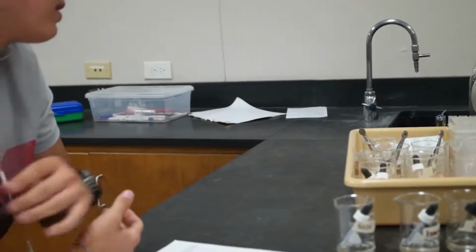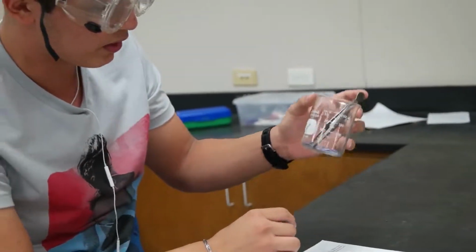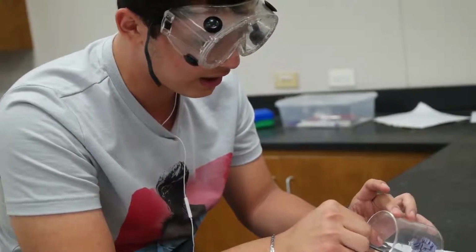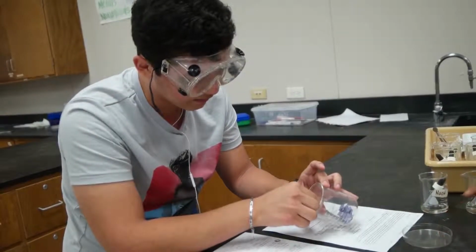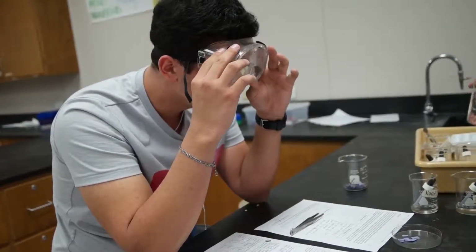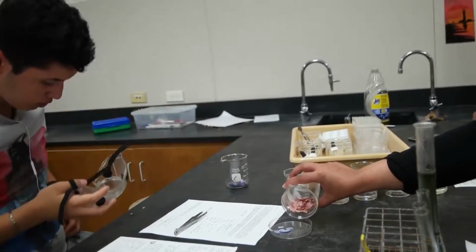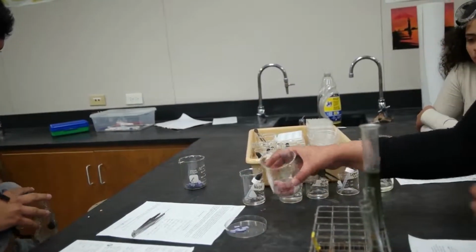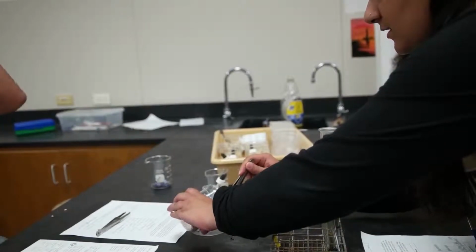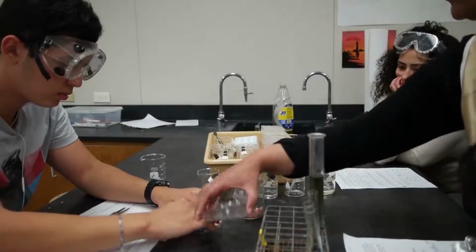Do you want to show how the test works? Basically, whenever you get blue litmus paper, if it turns red, it'll be an acid. If it stays blue, it'll be a base. We'll give you a little bit of purple and red. And what you can do is you can just drop the droppers directly into here. You can do a couple different samples. You can use different dishes for each one if you want.